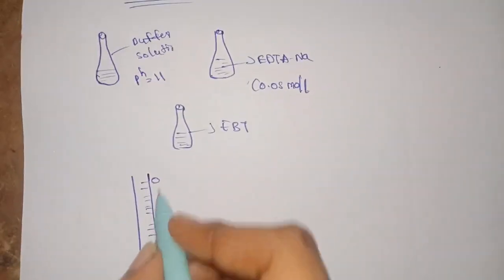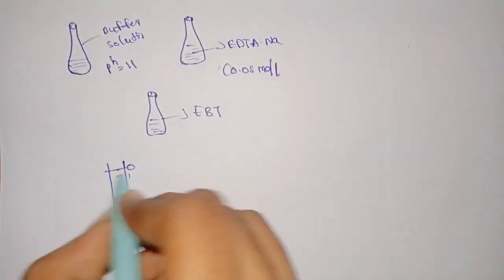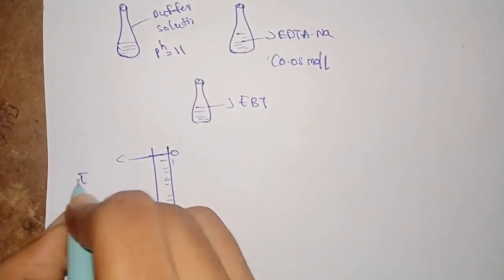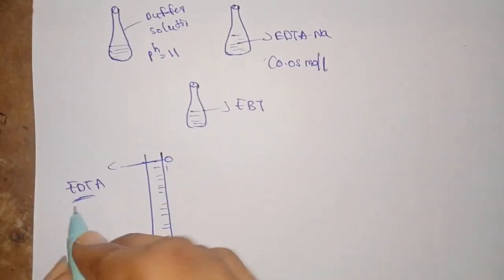So this is the burette. We have to fill it up to 0 with EDTA.